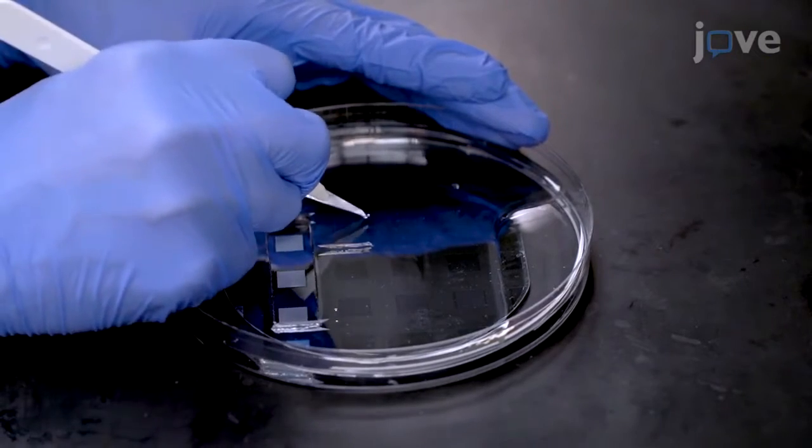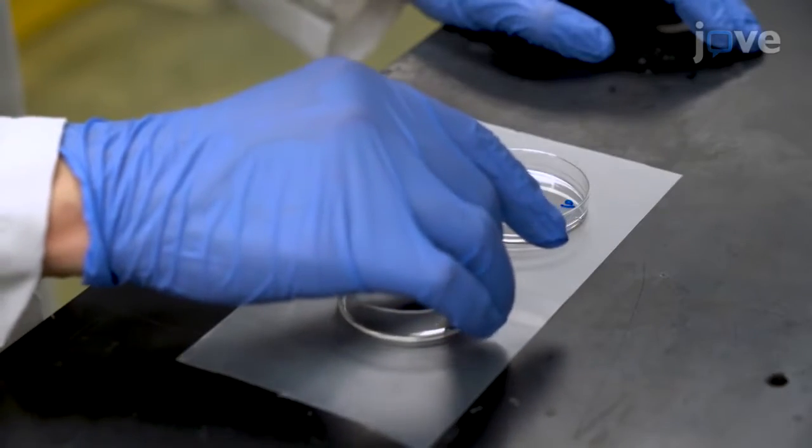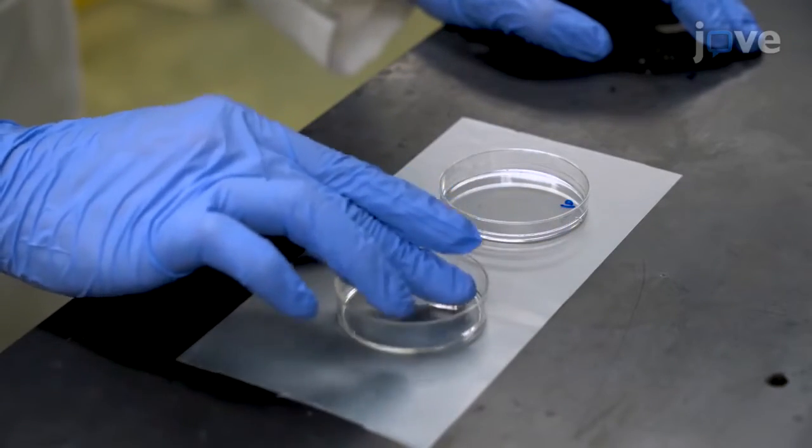It is also compatible with multiple cellular quantification methods such as immunofluorescence staining and Western blot. This technique provides a mechanistic understanding of Schwann cell biology, with additional insight into biomaterial design for nervous system regeneration, and can be applied to any anchorage-dependent cells.